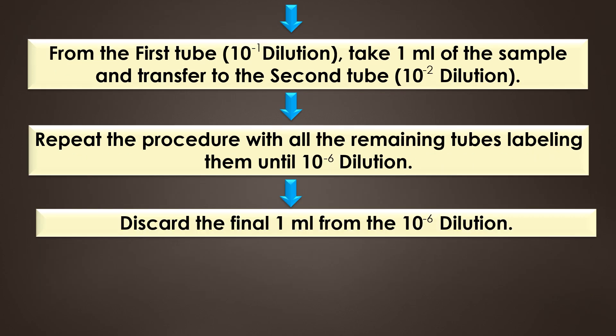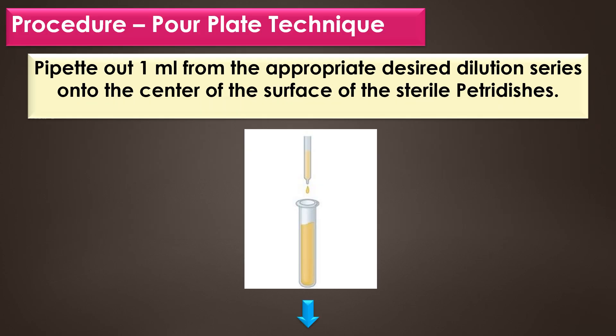From the first tube — the 10⁻¹ dilution — take 1 ml of the sample and transfer it to the second tube for the 10⁻² dilution. Repeat the procedure with all remaining tubes, labeling them up to the 10⁻⁶ dilution, and discard the final 1 ml from the 10⁻⁶ dilution.